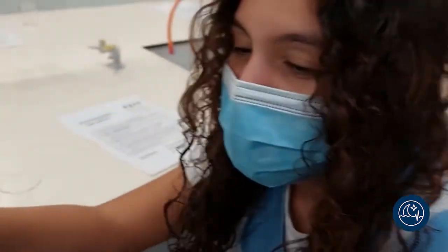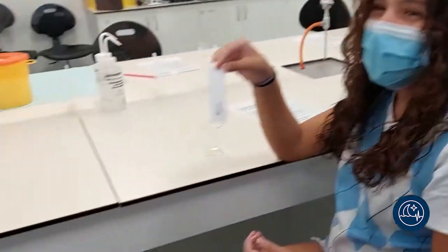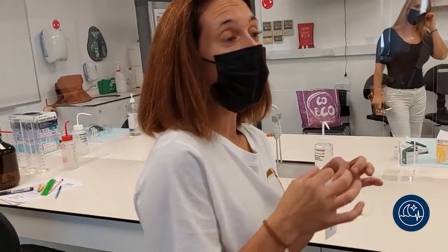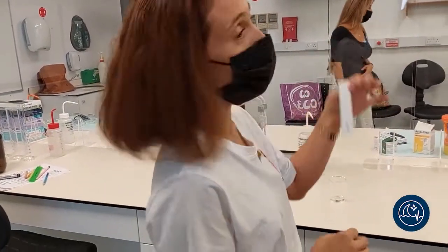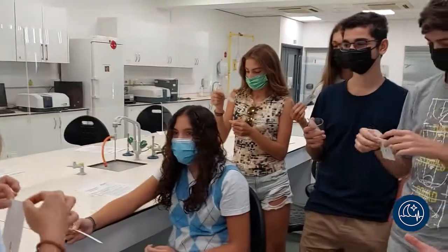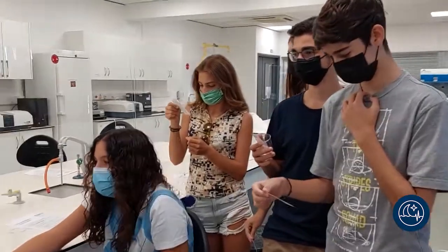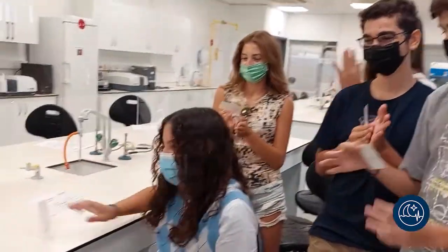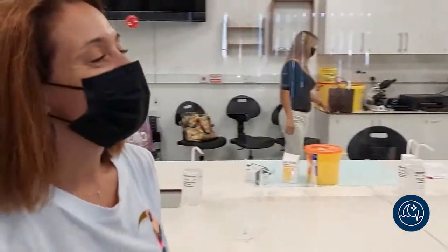So you can see that not all black pens are made of the same colours, and that we've managed to separate the colours found in the black pen. And we found our culprit. Round of applause for Nadasa. She did a very good job. Mine just decided to fly.